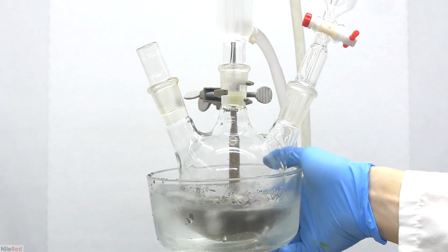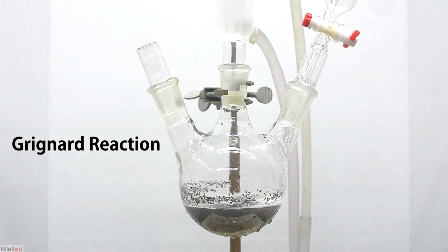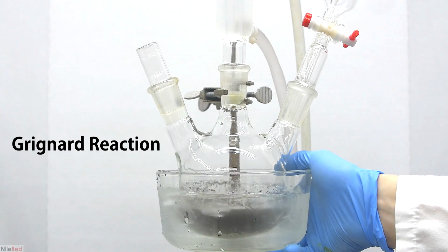To make the hexanoic acid, we will be carrying out a reaction known as a Grignard reaction. The Grignard reaction is extremely useful, and it allows us to create new carbon-carbon bonds.